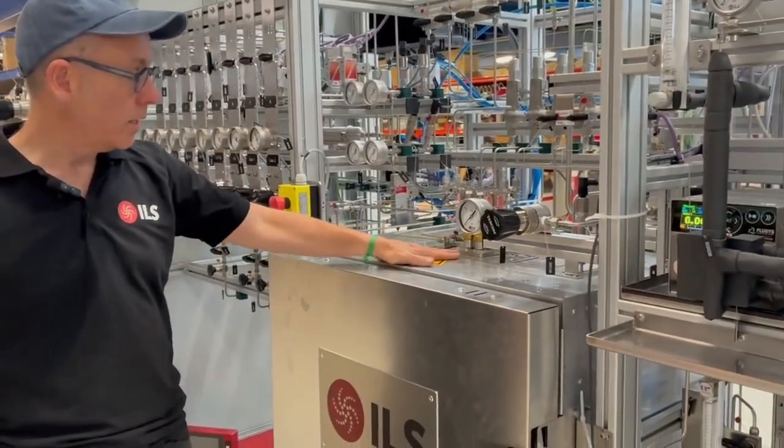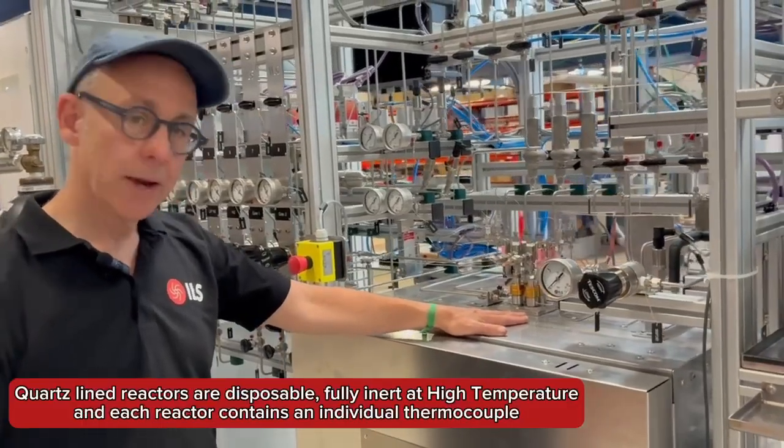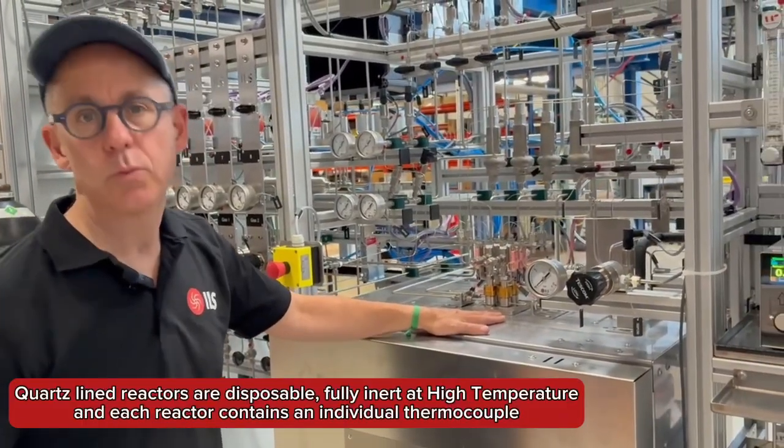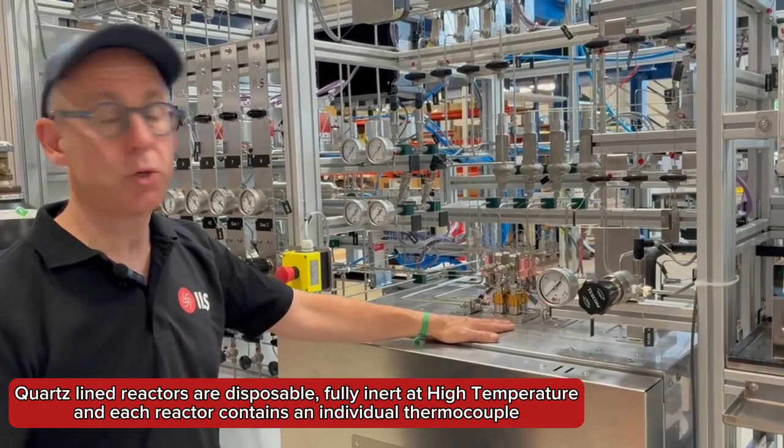This reactor concept is quite unique in the fact that we have thermocouples in each reactor, and the reactors are all glass or quartz lined, which means we really get zero blank activity in the reactors, even at high temperatures.